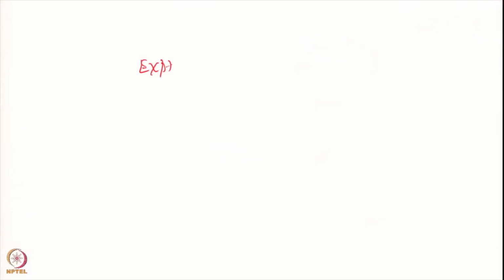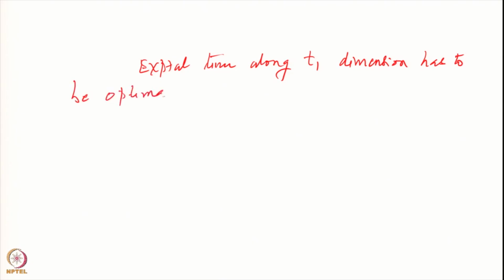So, the experimental time along the T1 dimension has to be optimally adjusted for the resolution we want.